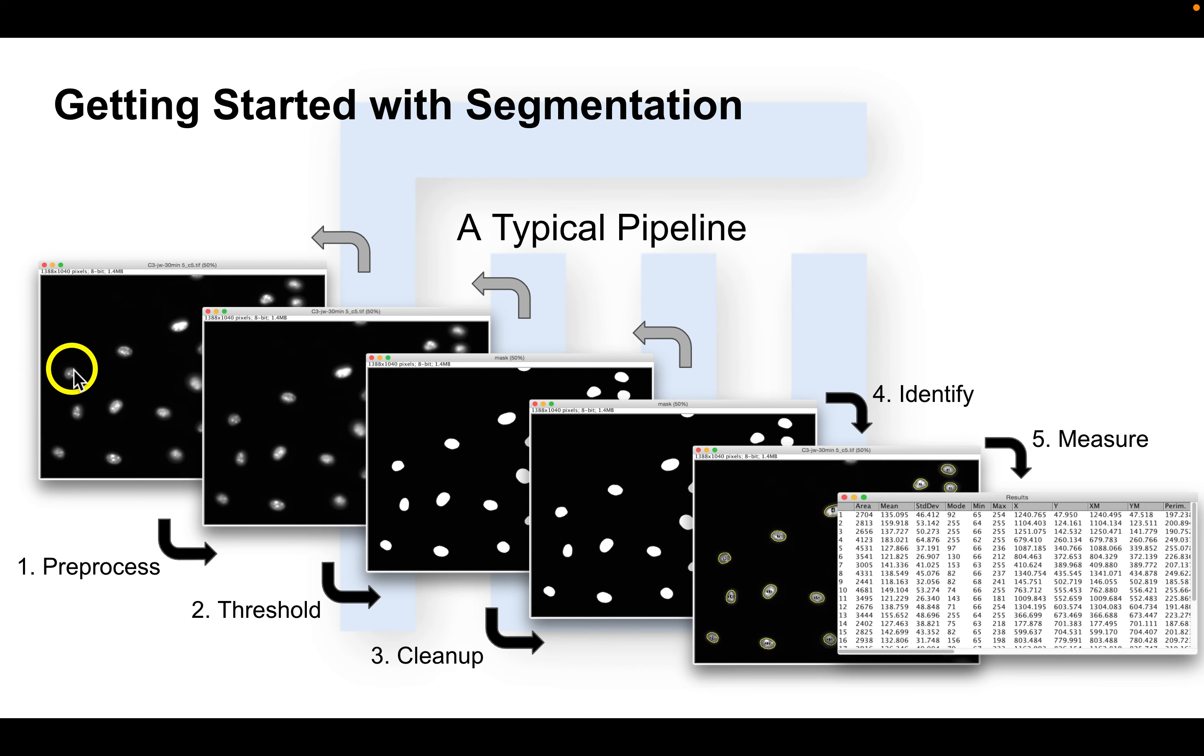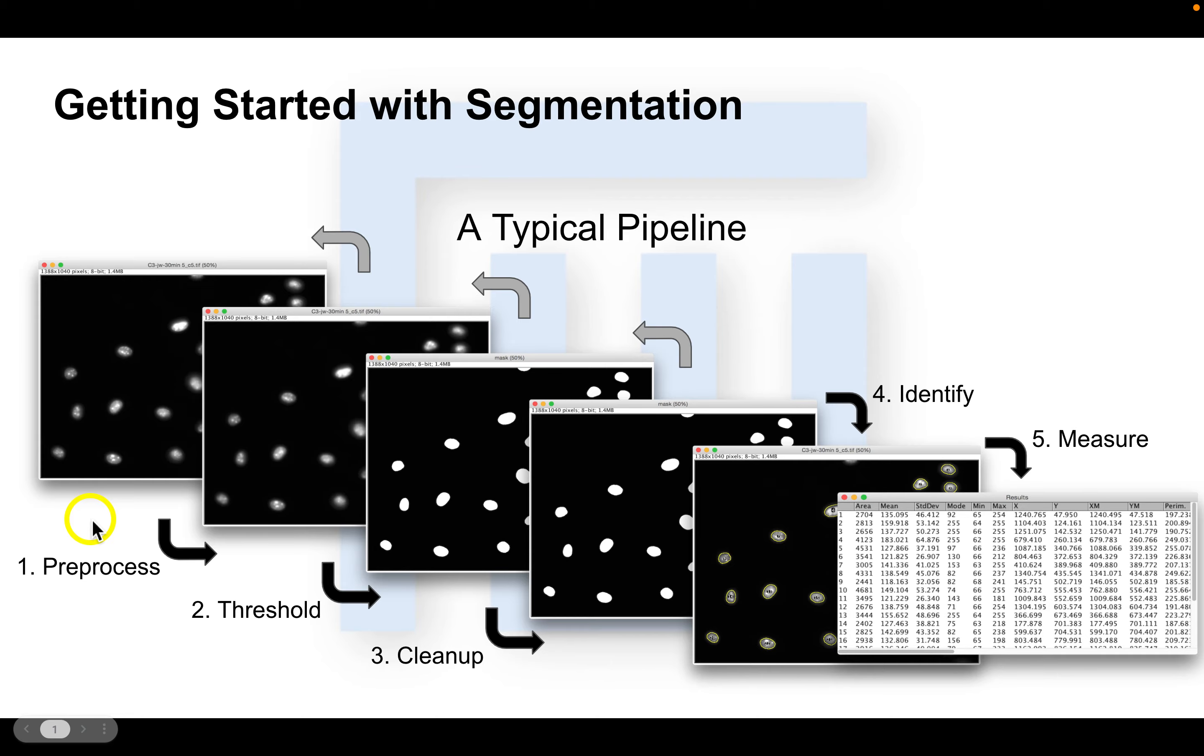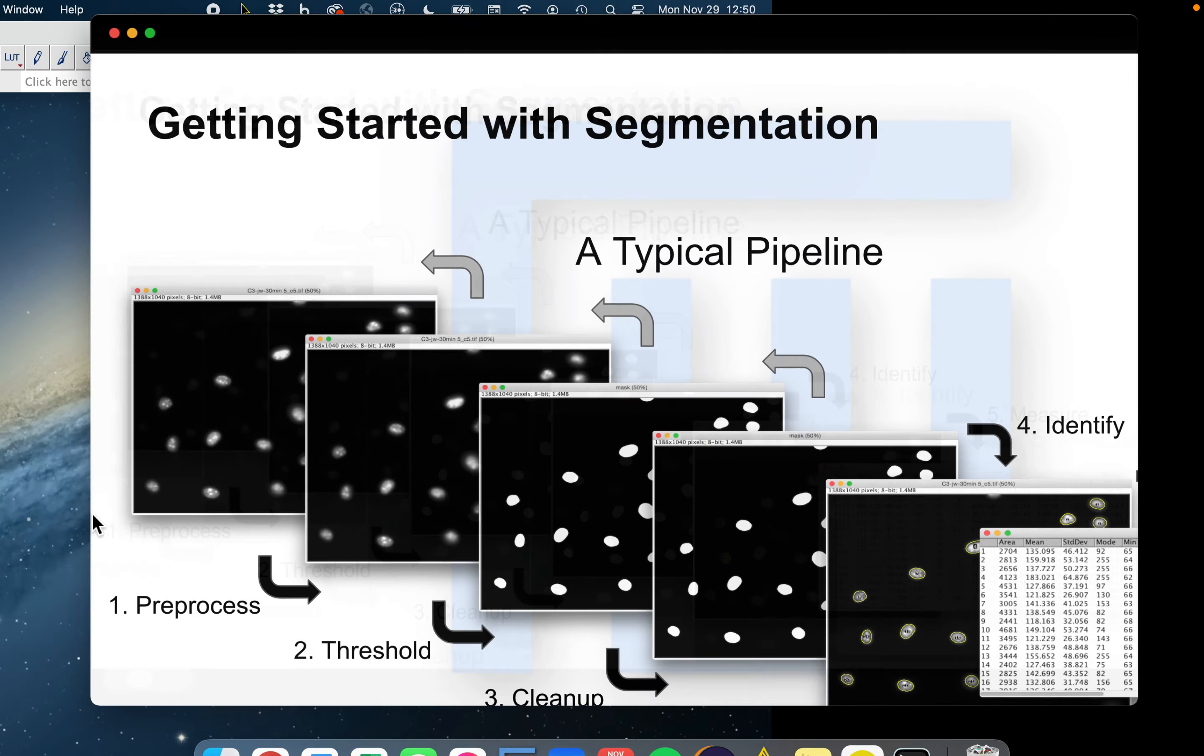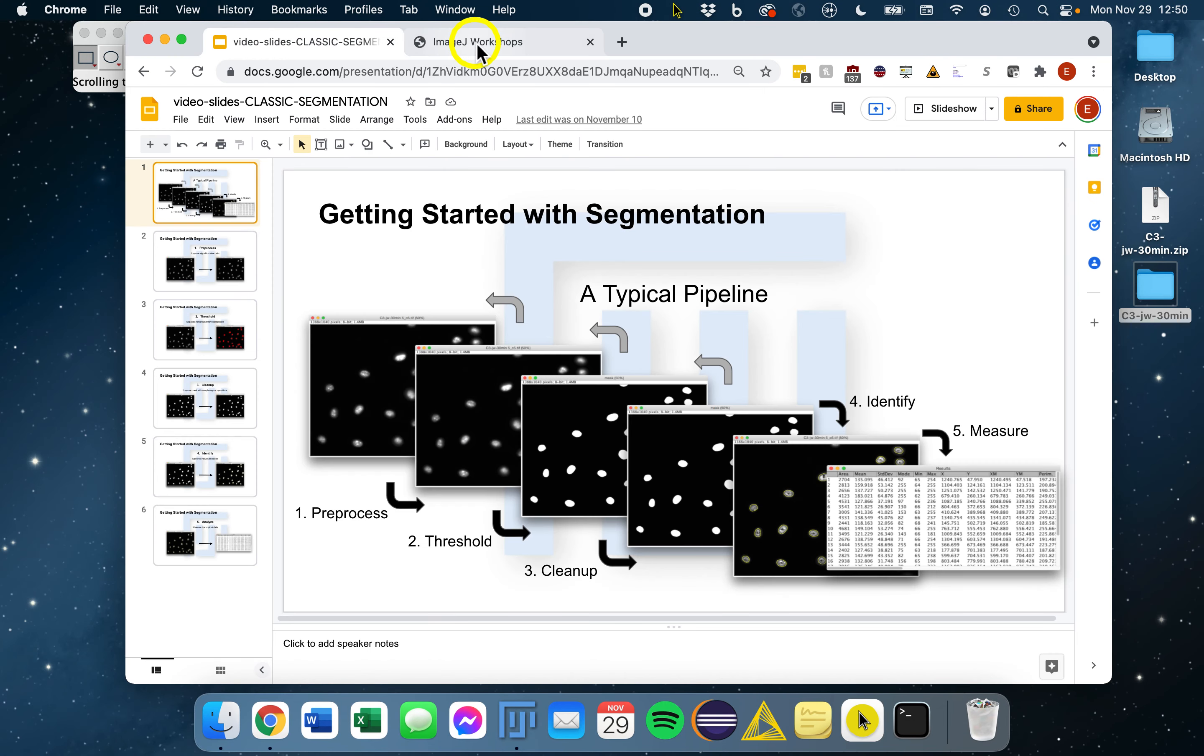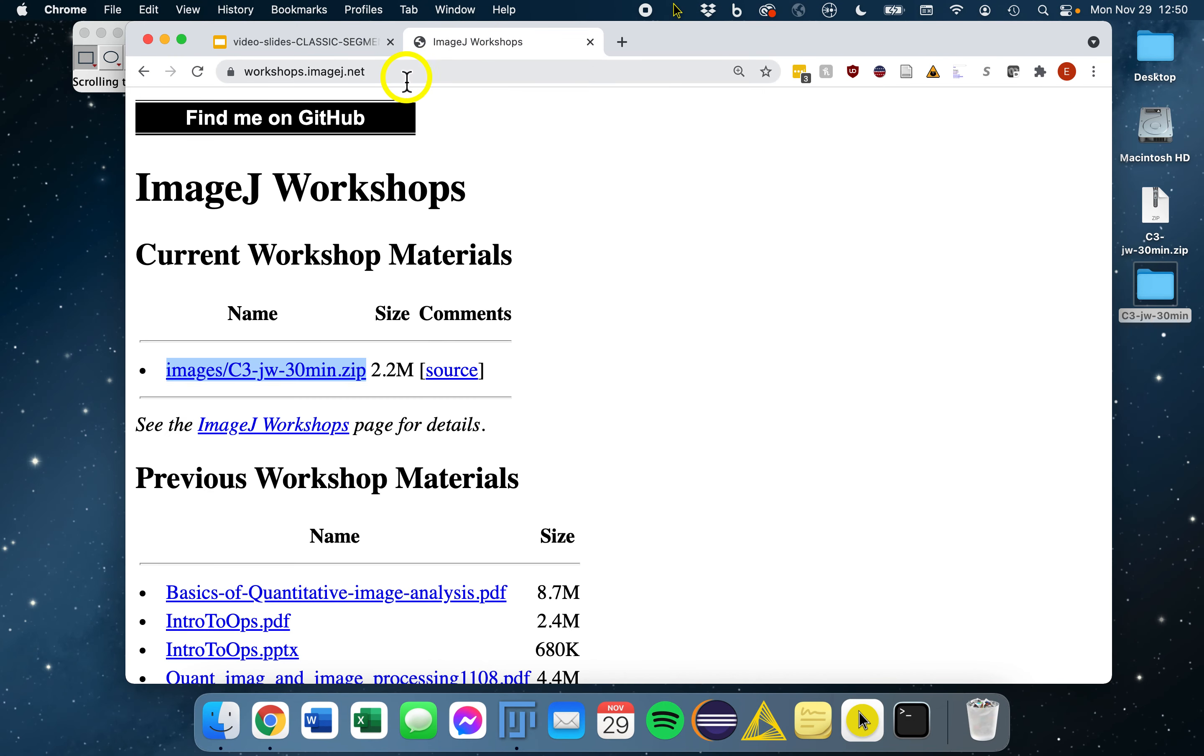Now to access the sample image that we'll be using in these segmentation videos that's shown here, you can go to workshops.imagej.net.